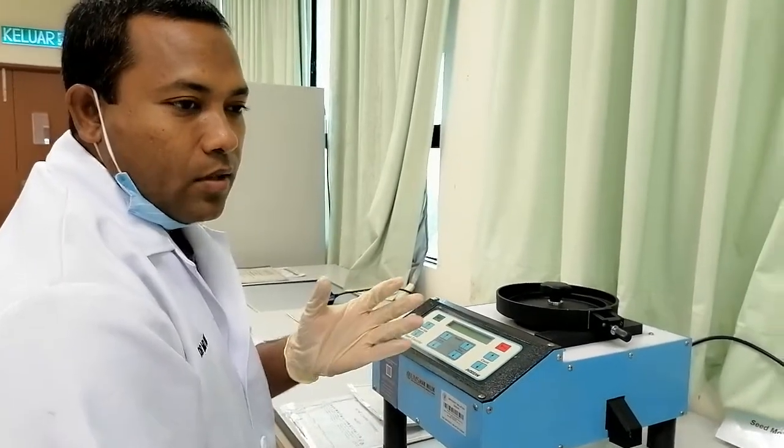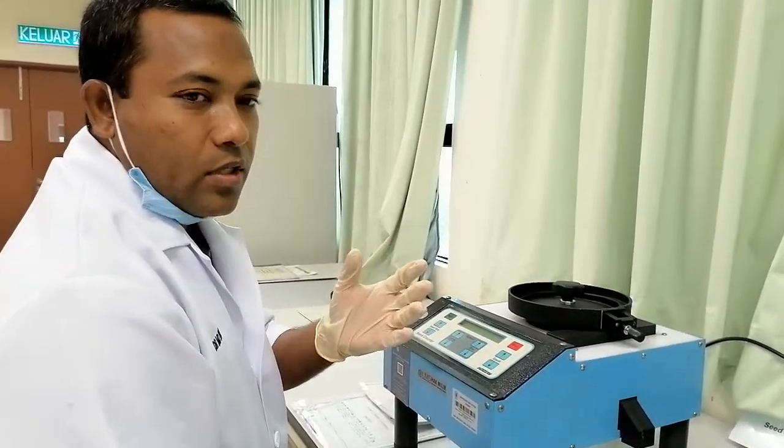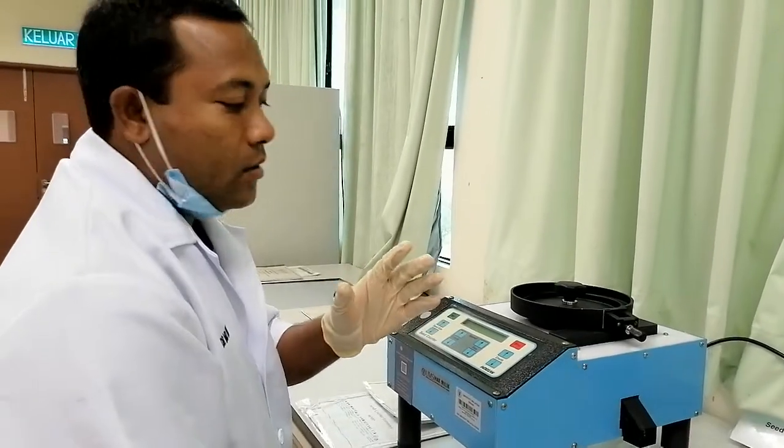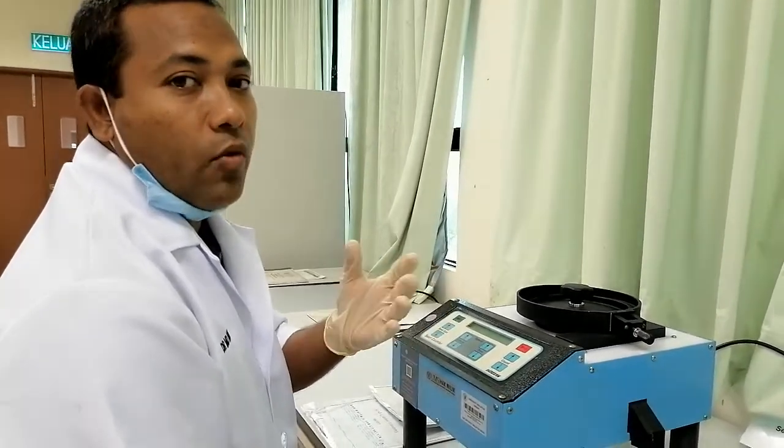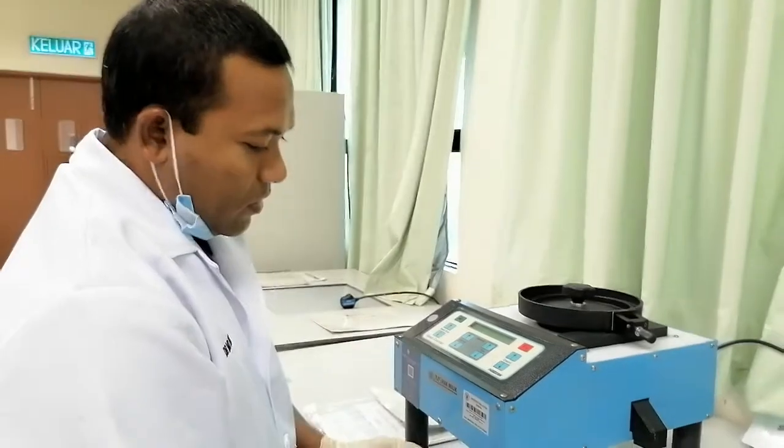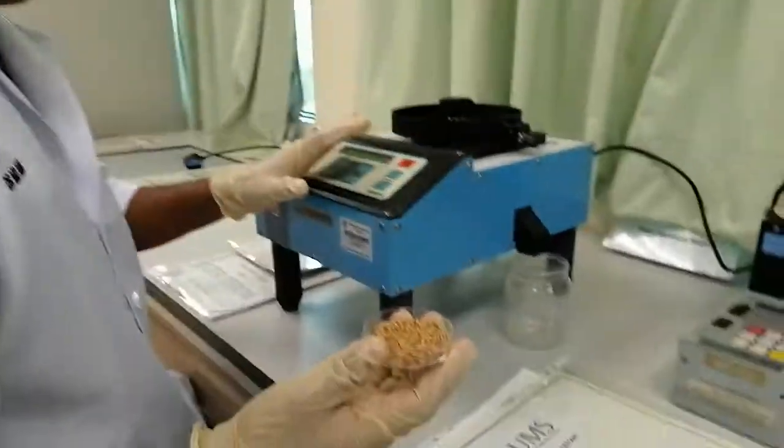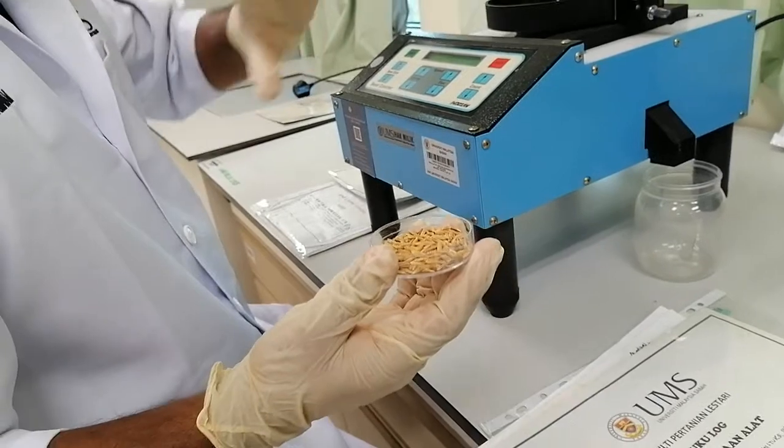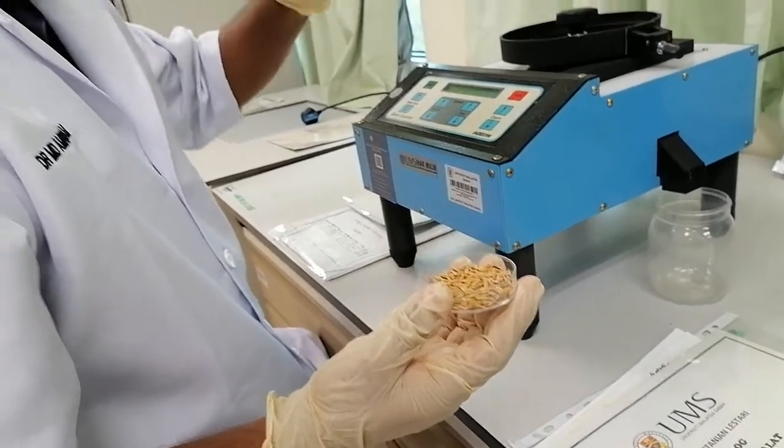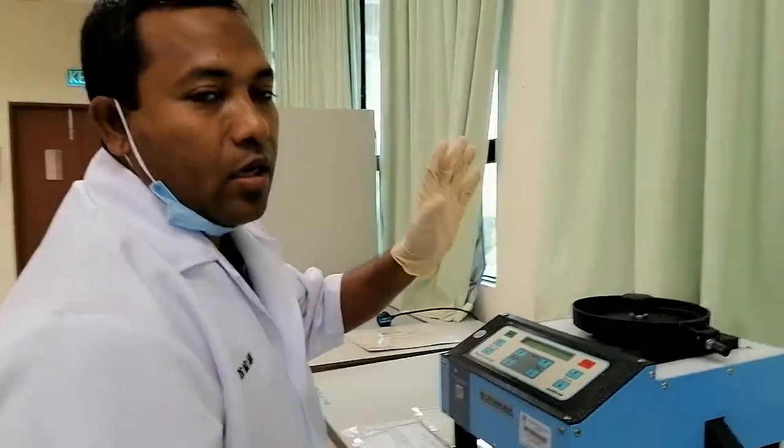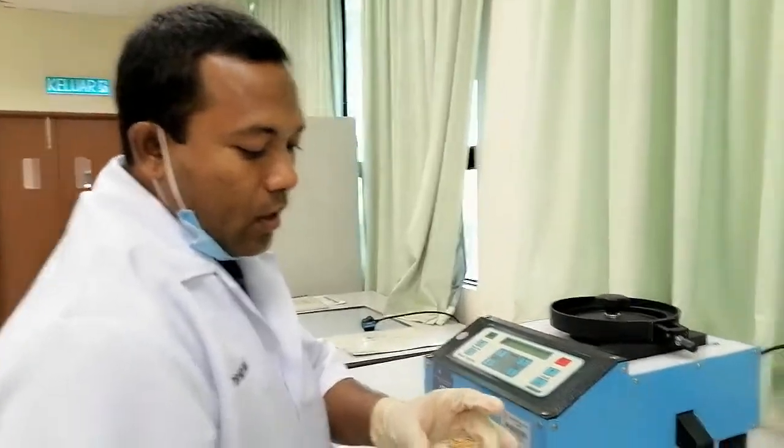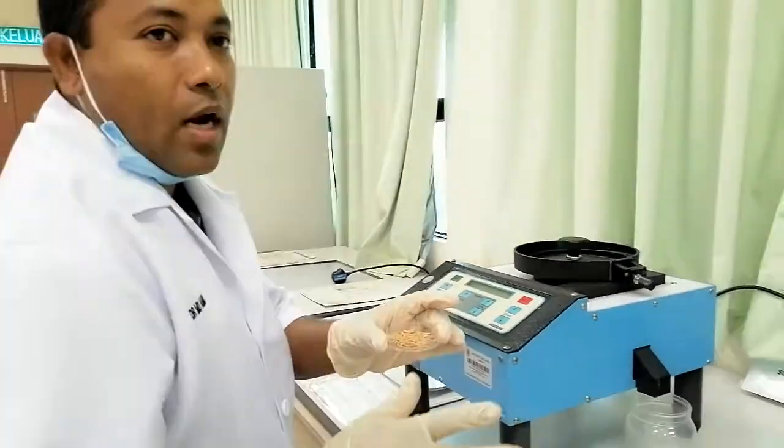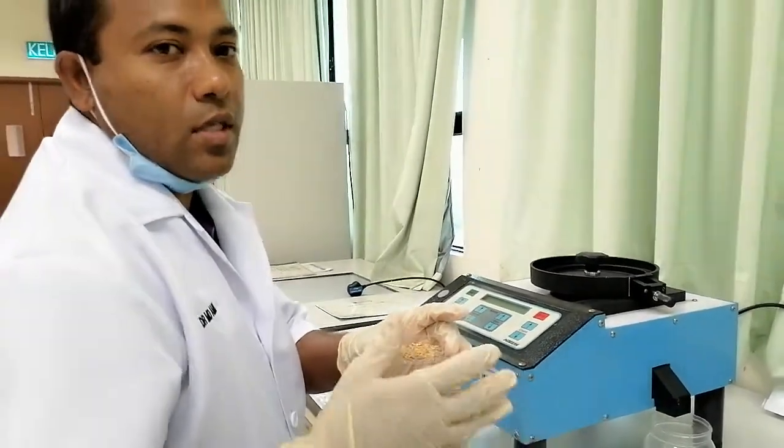Suppose for any experiment after harvesting, we need to count 100 seed or 1000 seed weight. So if it is rice, sometimes very tedious to count one by one because you have maybe so many replications, 5 replications, 7, 10 replications. So every replication we have to count the seed for 100 seed weight or 1000 seed weight.